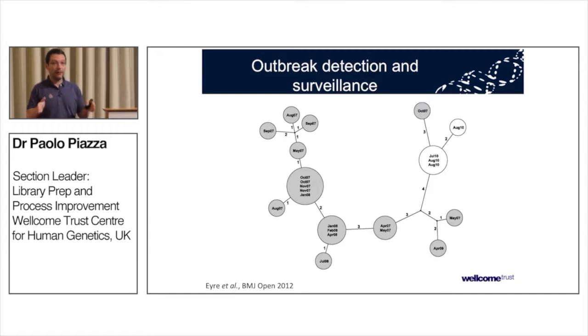We wanted to test how long it takes in a realistic workflow. And we managed to deliver the data from sample to data within a week. And in those days it was probably a couple of months to get to the same level. So it was a big impact. And the fact that MiSeq has been adopted in many clinical labs is also a confirmation that this speed is achievable and is quite important.